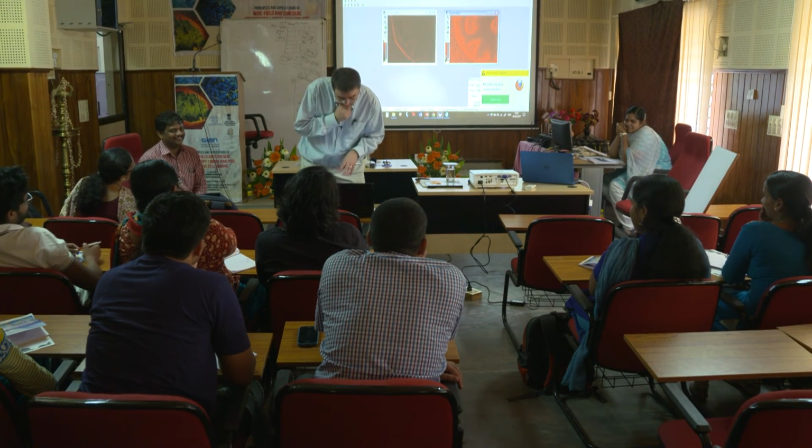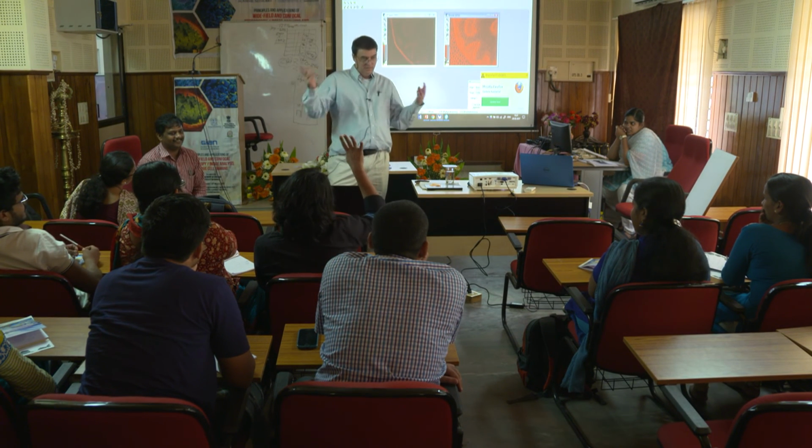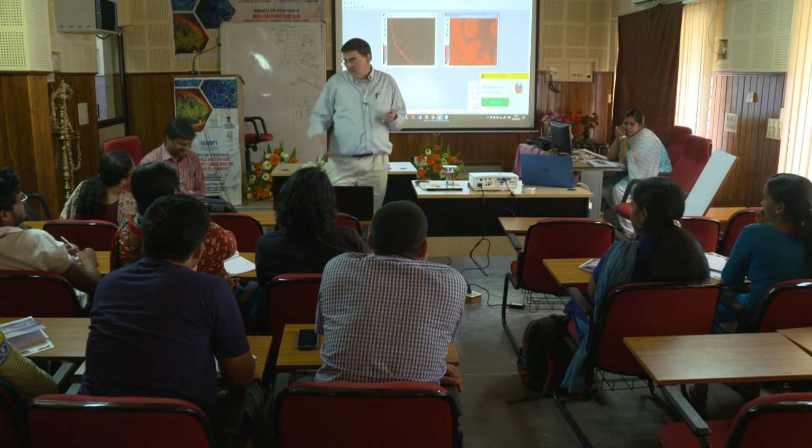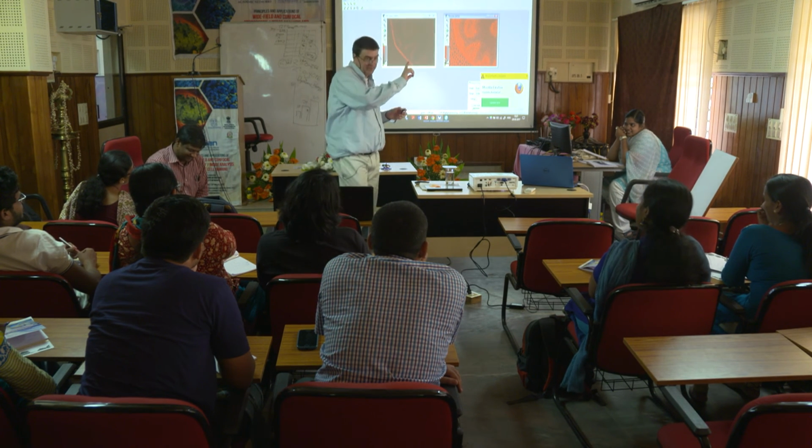Okay. To get an accurate measurement, you must do what to your microscopy system? You must calibrate. Exactly. Using what do you use to calibrate?